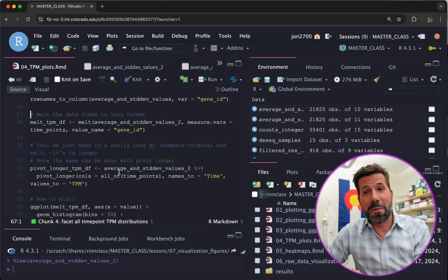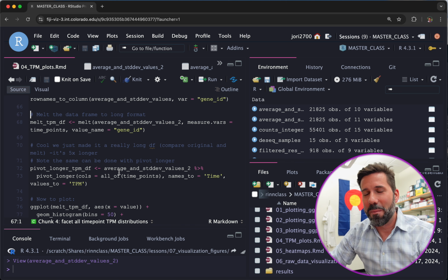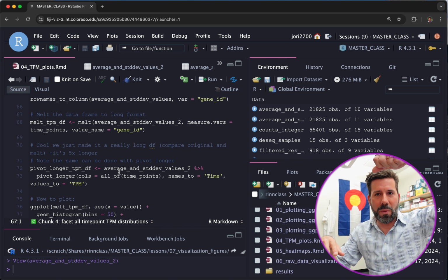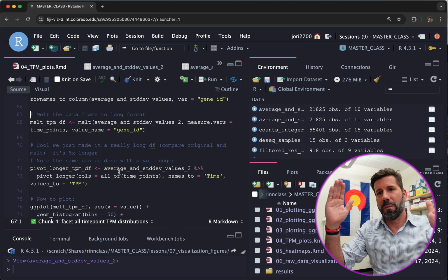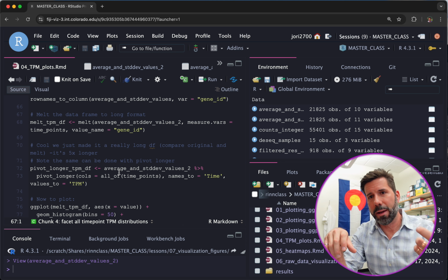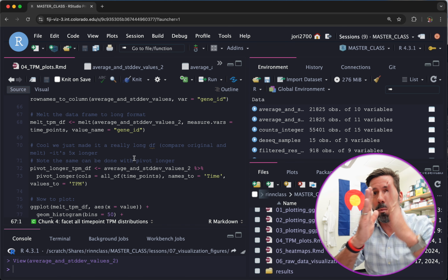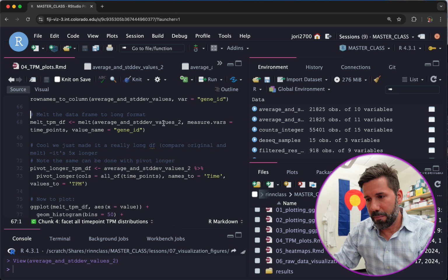Okay, so now we're going to do the fun part. We're going to melt the data. This takes a long time to get your head around, at least it did for me, but you'll get there. Essentially right now all of our data is across columns, and it's very hard for a computer to grab multiple things in a column and do something to them. We did do that with grep, but typically you would make each data frame stacked as rows, and then you can group by and grab things as rows instead of grabbing them as columns. So that's what melt, pivot longer, those things are going to do for you: take your wide data and make it long, so it's actually easier for the computer to grab comparable things.